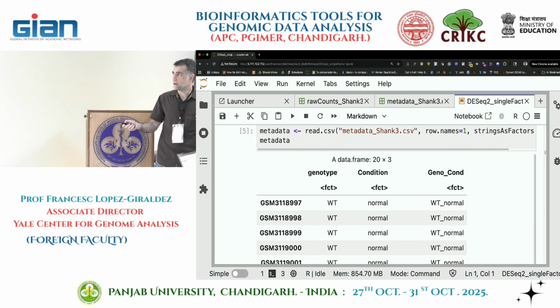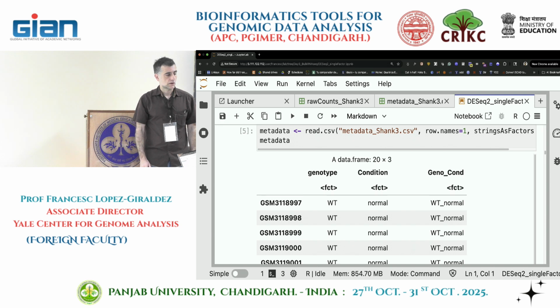Yeah, so here you're creating the grouping that you want to analyze with this table. Yes, and the genes are per group, whatever genes we are analyzing. You're creating the groups here. Yes, this is the definition of the groups. So every comparison in this data set is between the groups, and the genes vary between the groups.